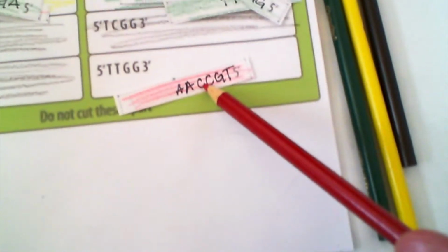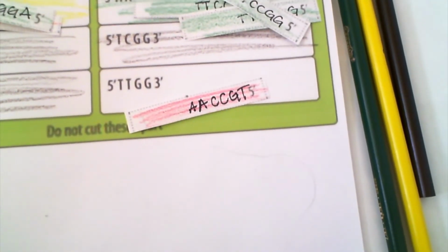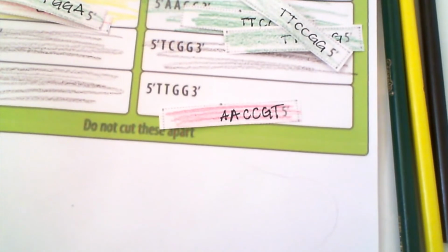And then this one right here, I did not do, but if I were to do, it would be colored red because there is 1 cDNA from the plant that was given no light, and so this gene is overly expressed in the plant that was given no light, and again, it would be a gene to look at.